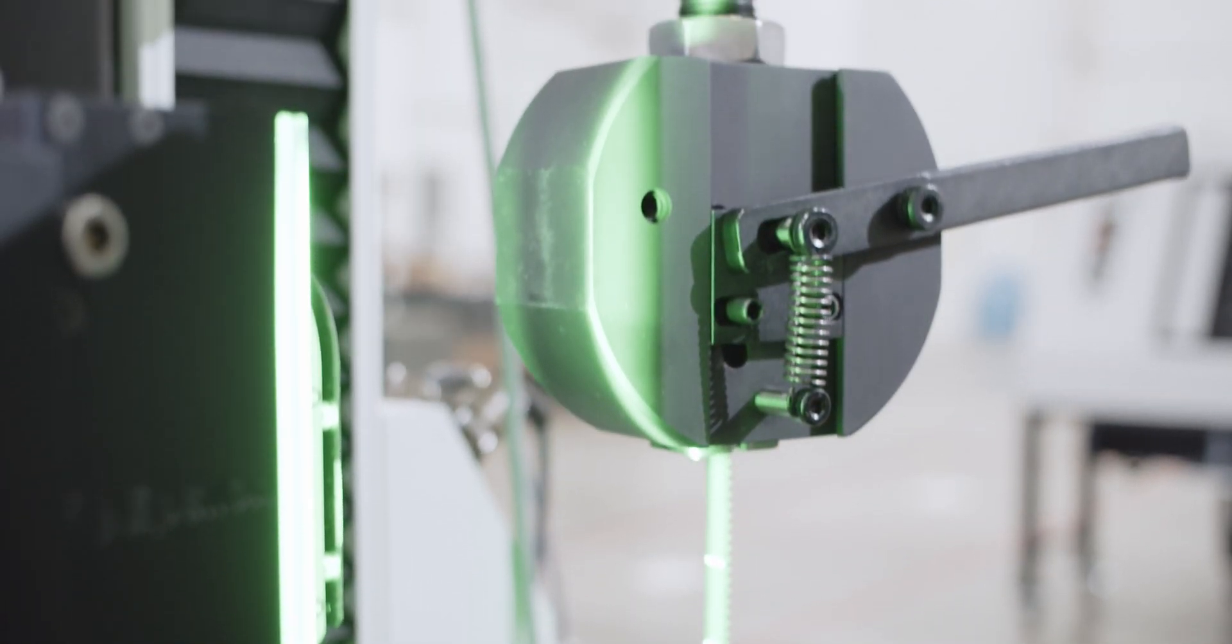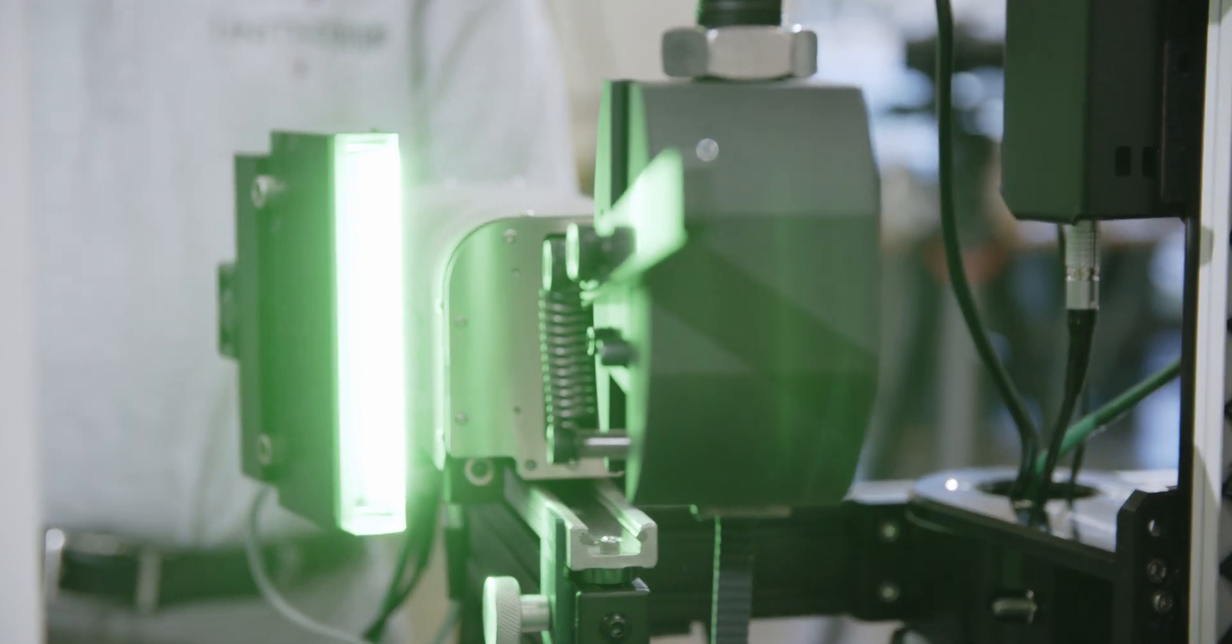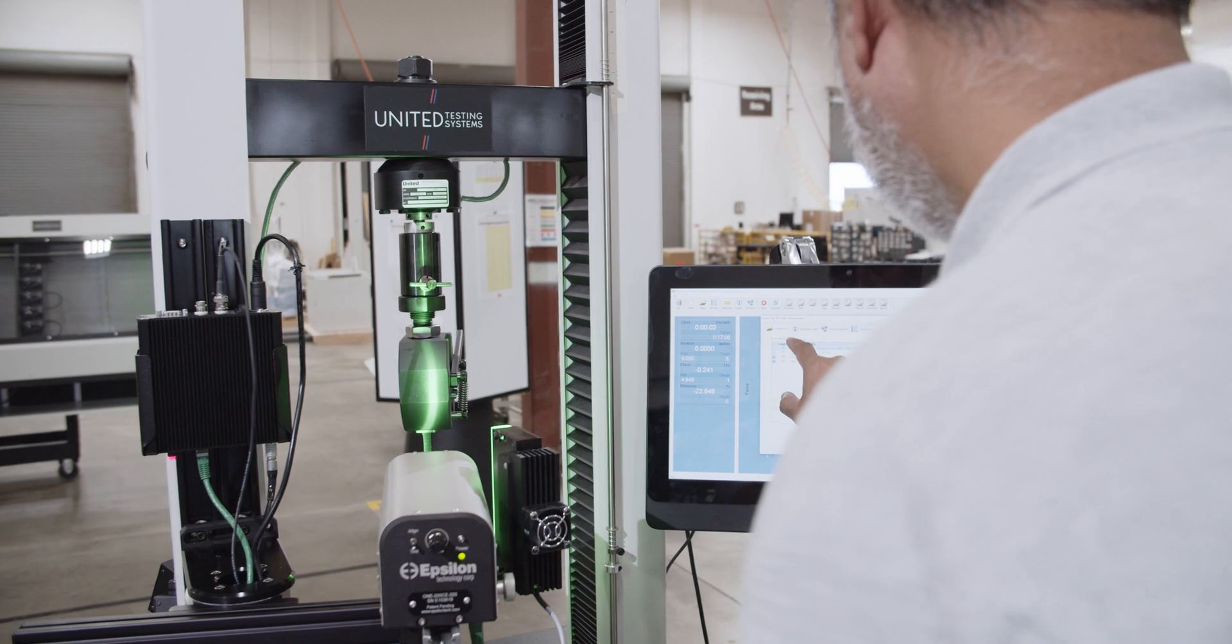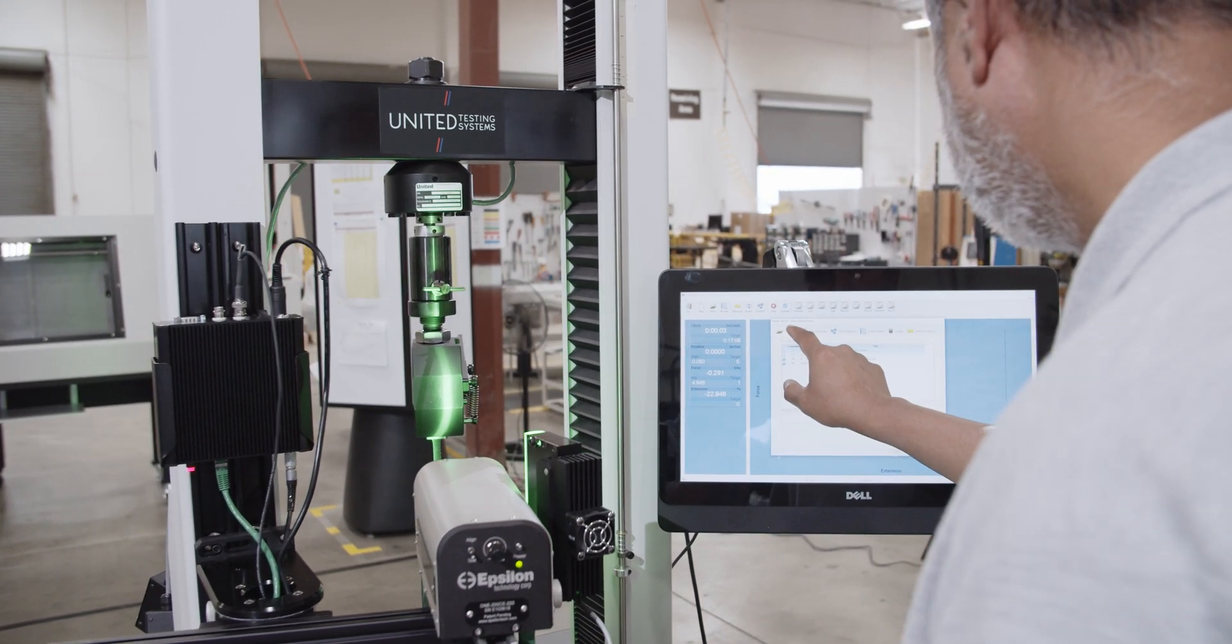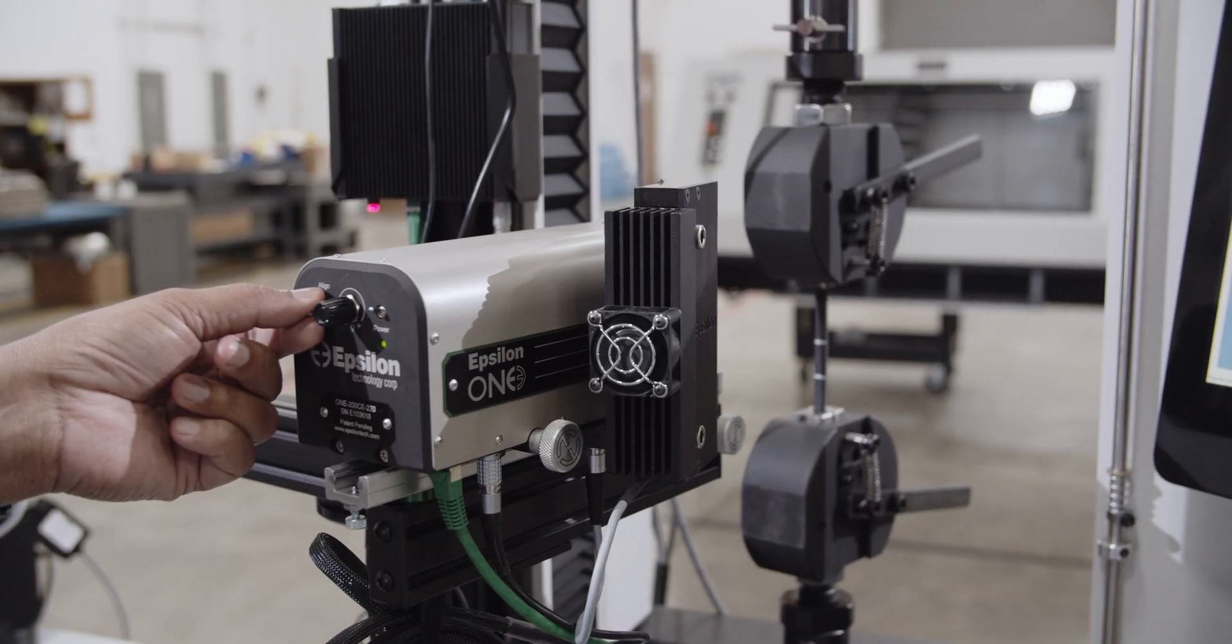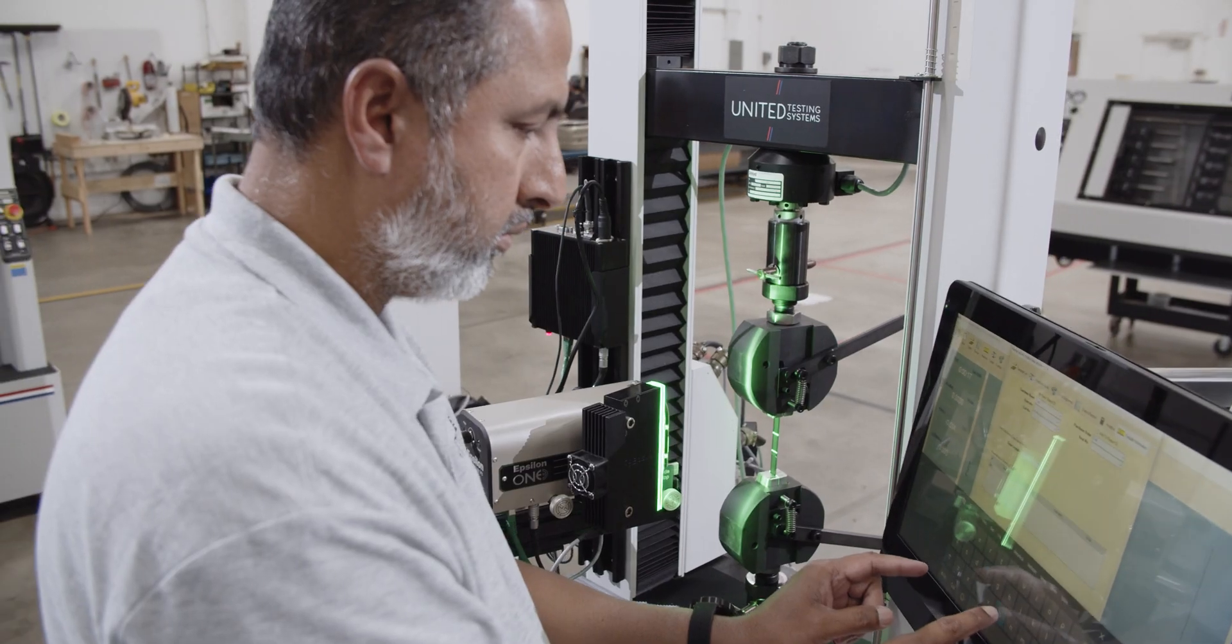Precision laser alignment and telecentric optics make the EP1 a precise and well-designed option, and the instant reset feature allows it to be ready in under 2 seconds. Many customers have moved to using optical non-contact extensometers for several reasons in addition to the higher accuracy they provide.